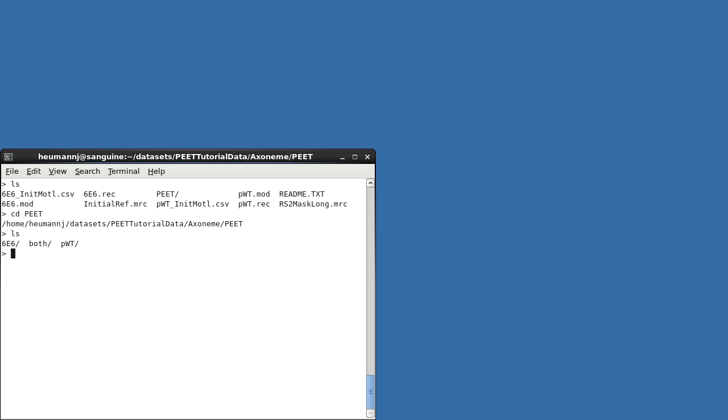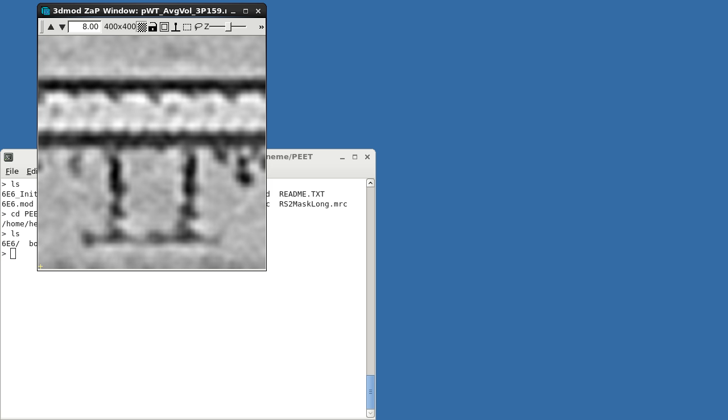I've already run alignments in each of these directories. If we open the pseudo-wild-type average, you can see that we're looking at the top portion of a longitudinal cross-section through the axoneme. The central microtubule pair is just off the bottom of the screen, and you can see radial spokes 1 and 2 running between the central apparatus and the a-tubule of the microtubule doublet near the top of the screen. Chlamydomonas also has a characteristic, shortened Radial Spoke 3.